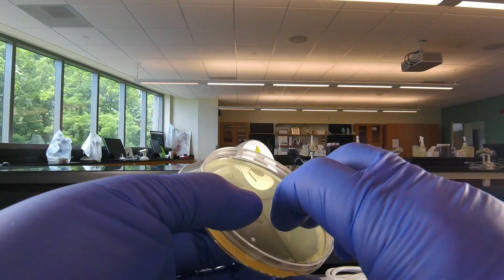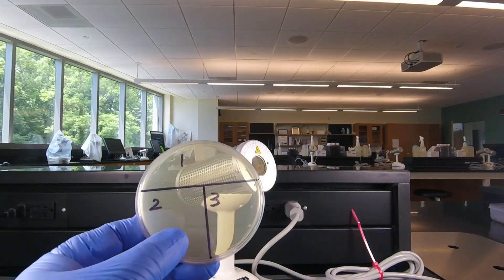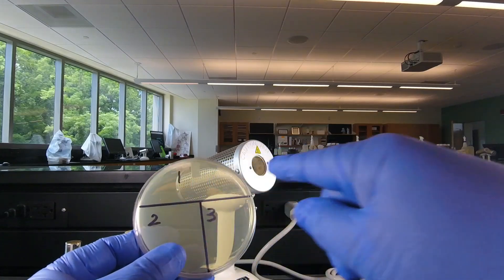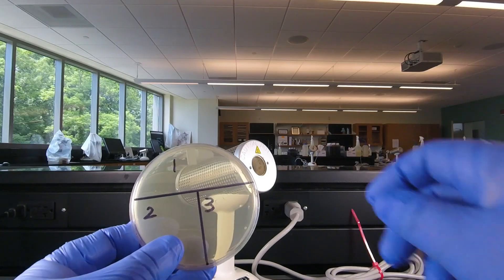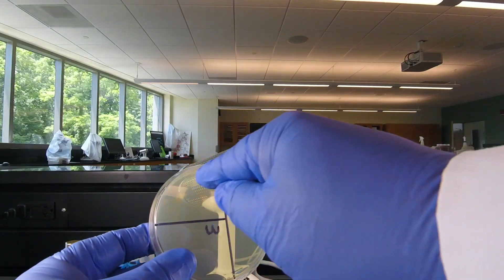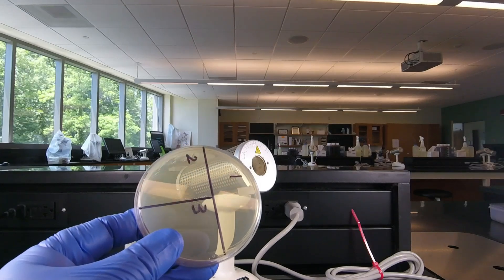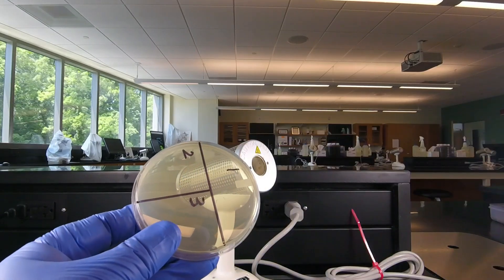To guide you in the streaking, we normally have you label the plate, as we see here, dividing it into three sectors. We're going to streak the bacteria just on sector one until we cover pretty much the whole area of that sector. Then we sterilize the inoculating loop and use a sterile loop to spread some of the bacteria from sector one over sector two. Then we sterilize the loop again and spread some bacteria from sector two over sector three, and it's in sector three we'll probably see isolated colonies.